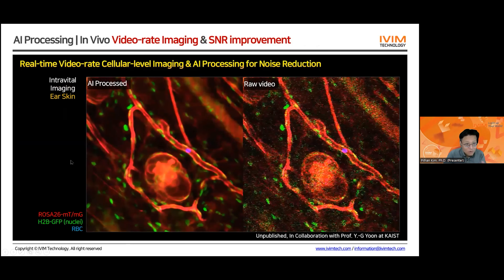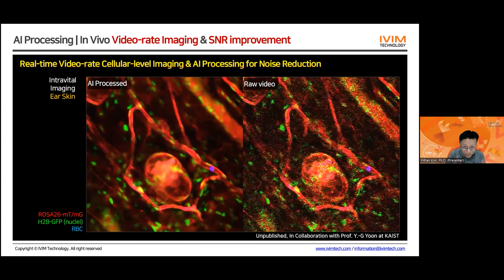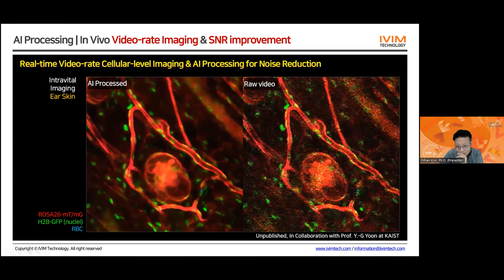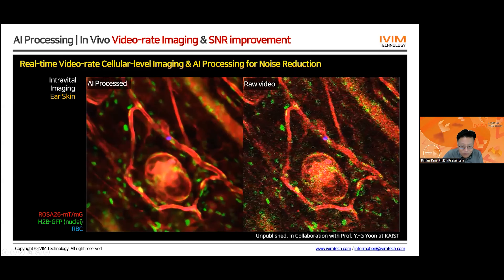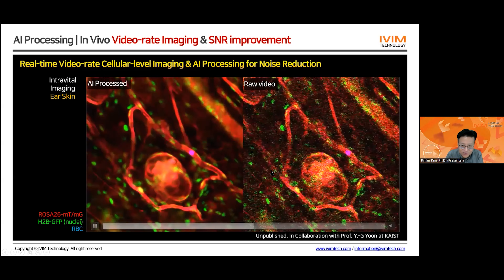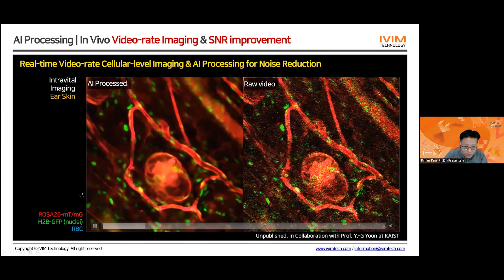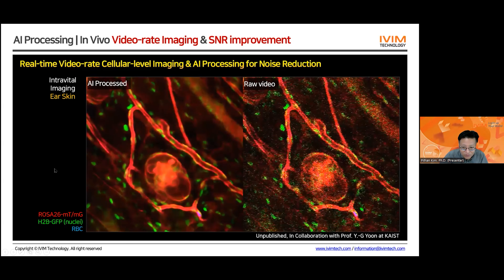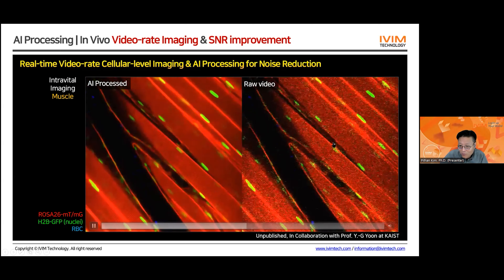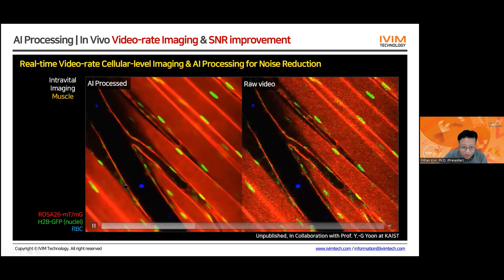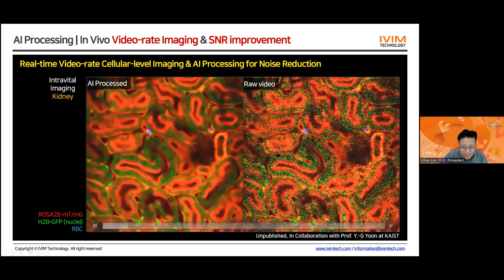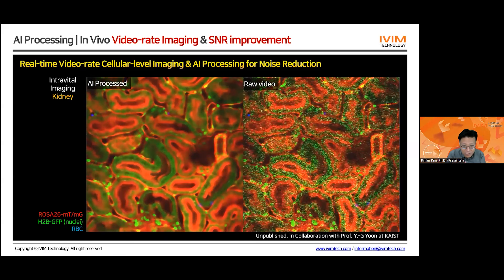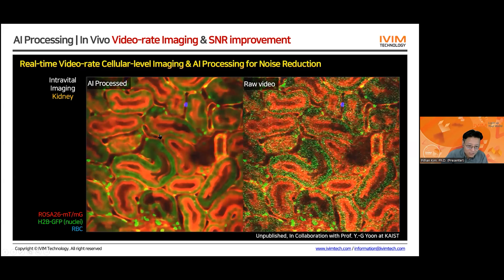Very recently, we developed an AI processing algorithm to reduce noise in this real-time video. This is the raw real-time video obtained with our microscope, and we can process it using our AI network model to very effectively and efficiently remove noise and produce this processed data. You can nicely see the flowing red blood cells in the capillary of the ear skin of this mouse model. Before and after AI processing for noise reduction — we can keep both temporal and spatial resolution at the same time.